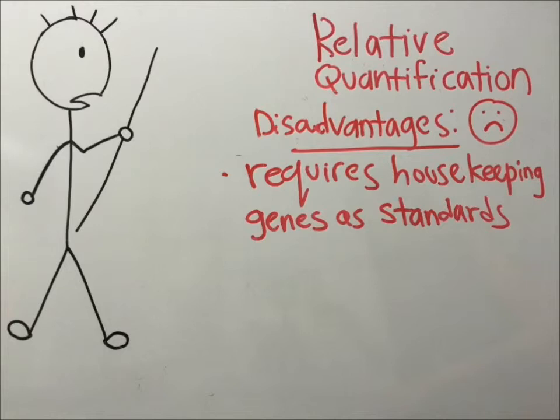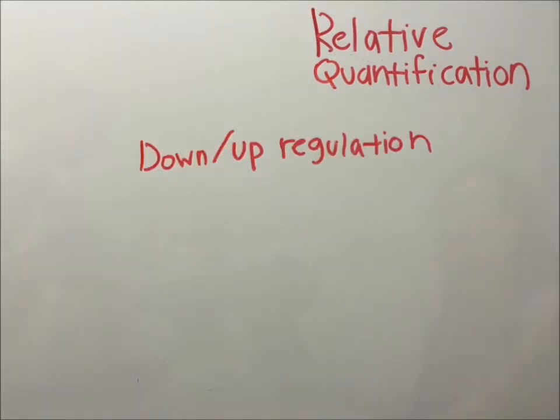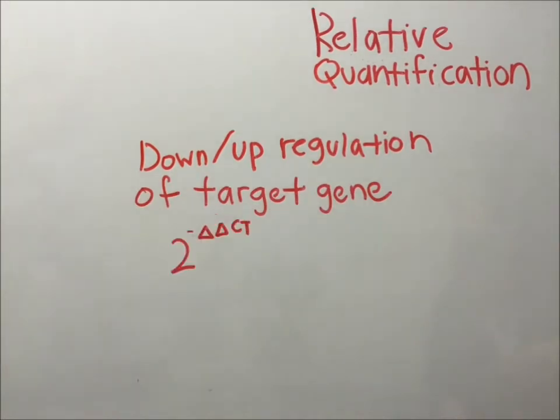Housekeeping genes are considered as constitutive genes, where they are transcribed continually as opposed to facultative genes. They are also expressed by all cell types and do not vary under experimental conditions. Tom knows that some commonly used housekeeping genes are the TATA box binding protein, ubiquitin C, and the MHC class I.